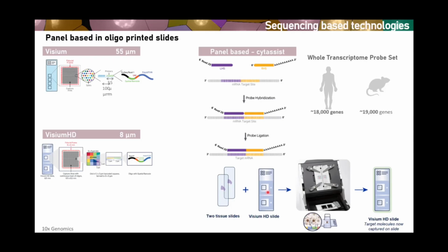on the expensive barcoded surfaces. You can section your tissue on a normal histology slide. You can check that it has the section, the position, the quality that you're happy with. And then there is this machine called CytAssist that creates a sandwich between your tissue that has been incubated overnight with the probes and the barcoded capture area.